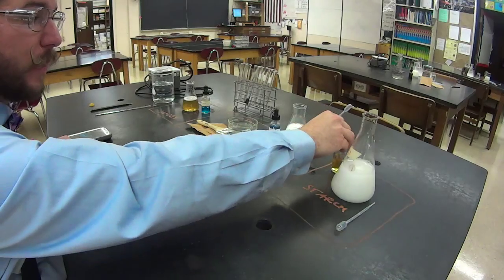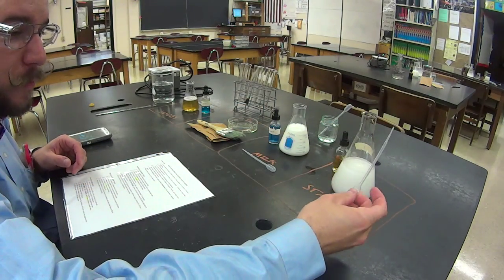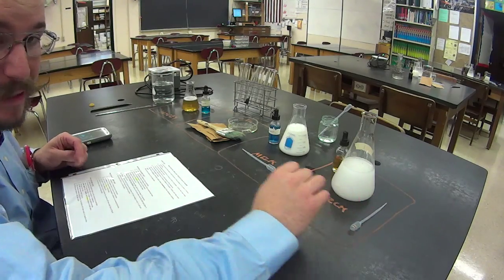You're going to use the iodine to test for the starch. And make sure that the starch pipette gets back in the starch box. Otherwise, the things will get all cross-contaminated.